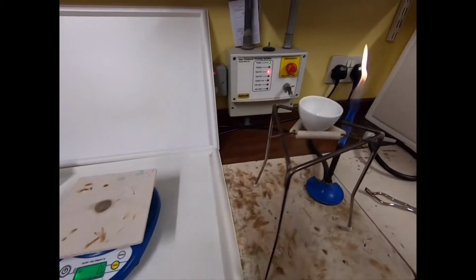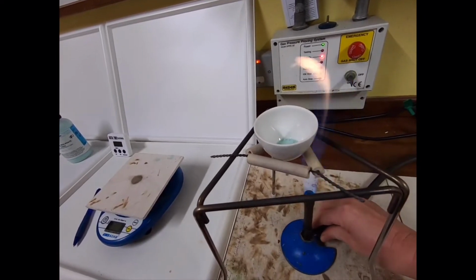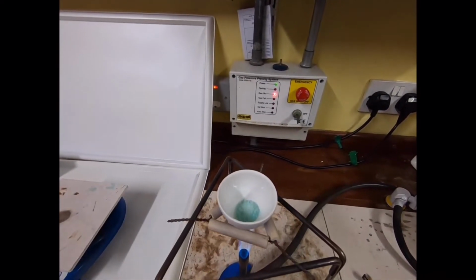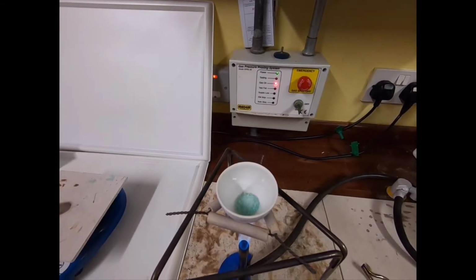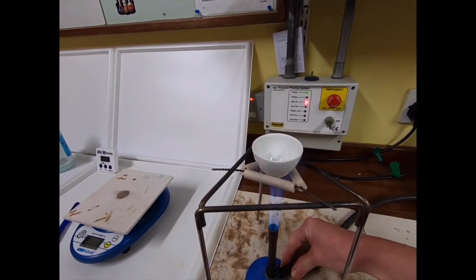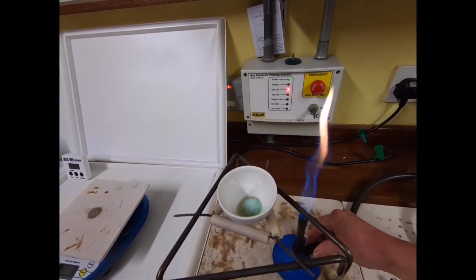And we're then heating it. Now remember, when you're using your Bunsen burner, you have it on the safety flame when you're not using it, and then when you put it in underneath, you would turn it on to the blue flame for heating or open the air hole fully for a roaring flame. Now at this point you could put a crucible lid on it. That would help it stop reacting quite so vigorously depending on what you were using. So if you were burning something quite reactive like magnesium, you would want to have a lid on it. In this case, it's just removing some water, so it's not as essential to use a lid.